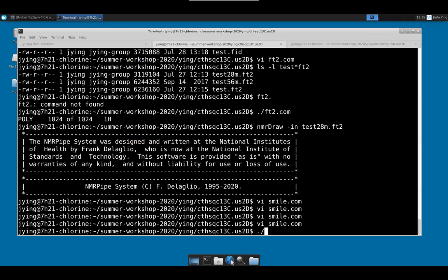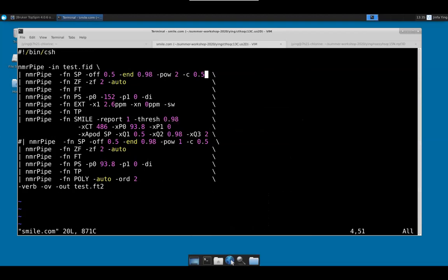Okay. Can I just confirm something? Yes. That you said? So someone asked about extending the direct dimension of your spectra.